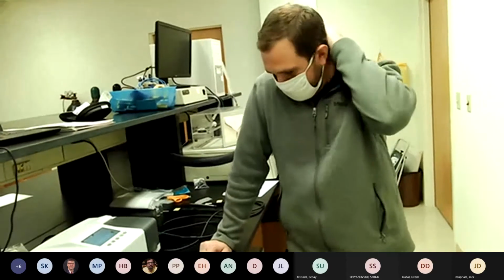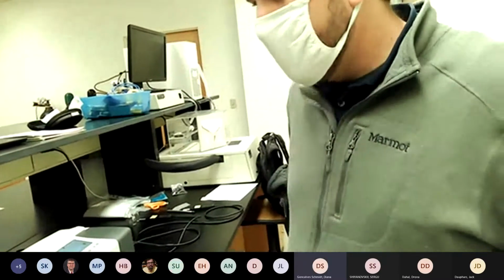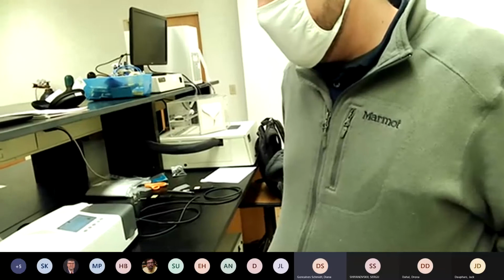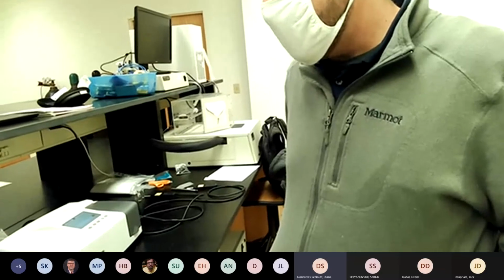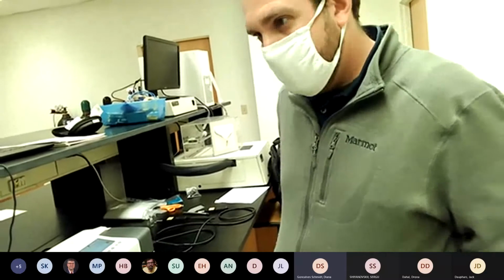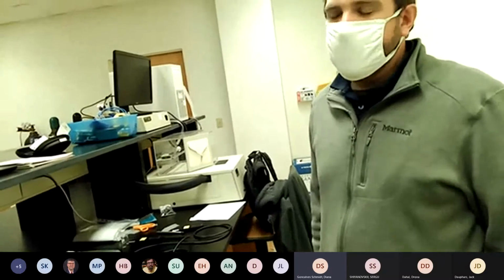Yes, I have a question. I wasn't here in the first few minutes when you started. So can we measure the sample inside the instrument? Because I've only seen you using the fiber optics externally.